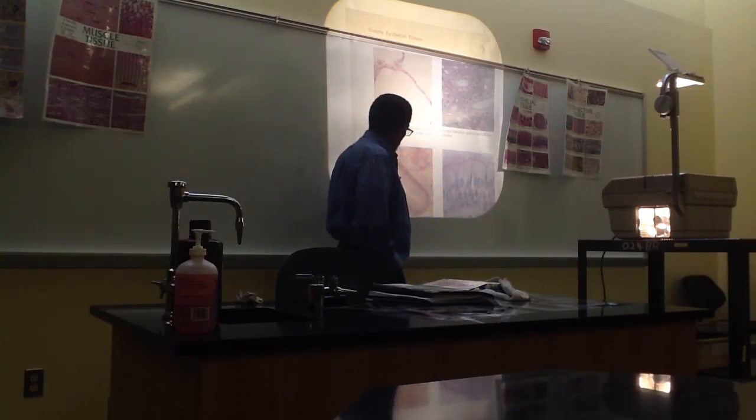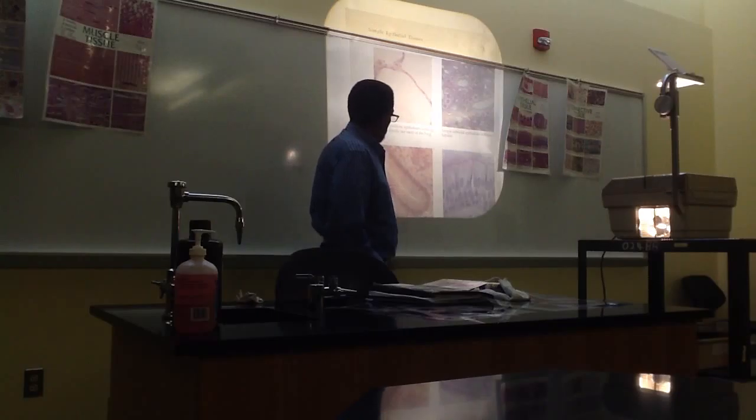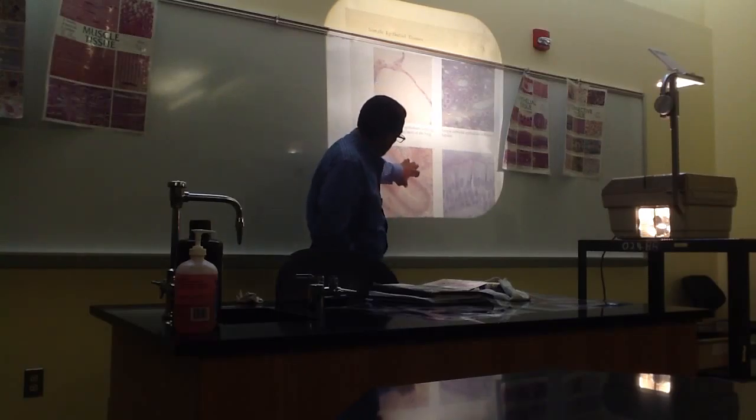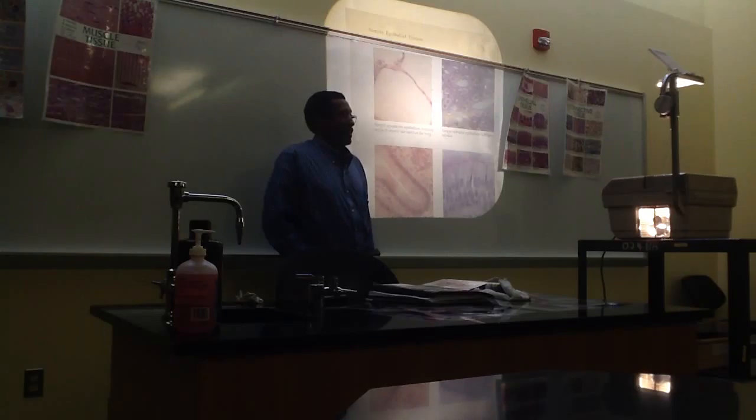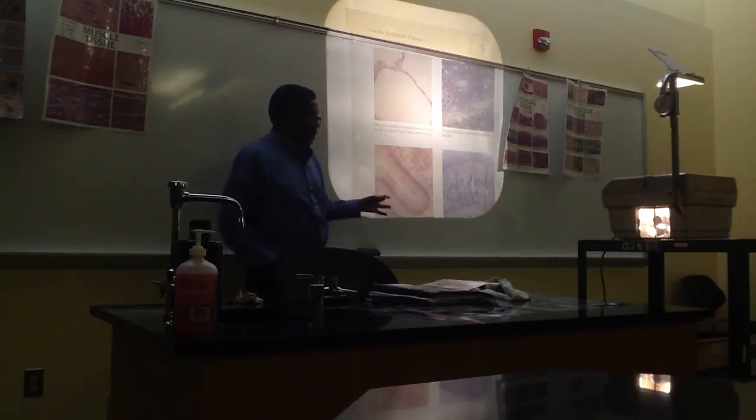All right, how would you identify this tissue? This tissue right in here. Columnar. Exactly. Simple columnar. All right, everybody got that one?